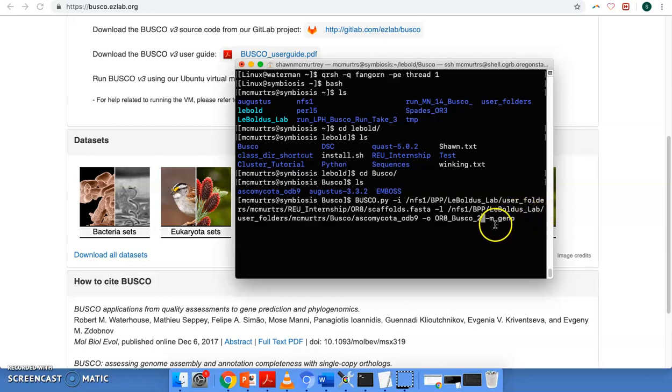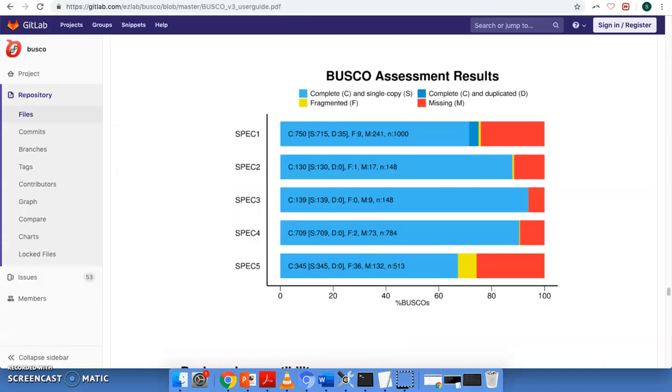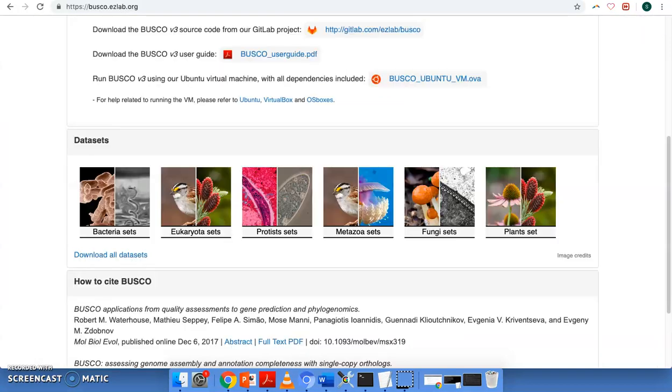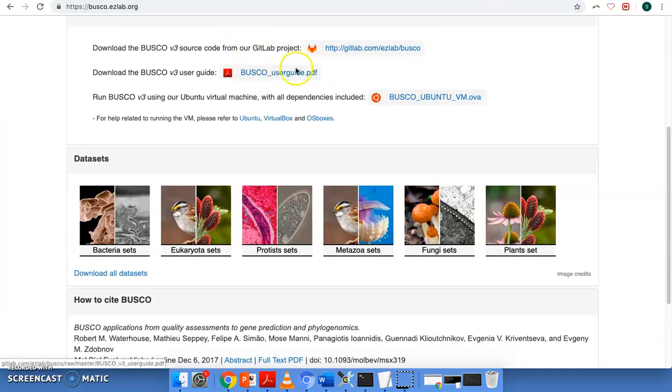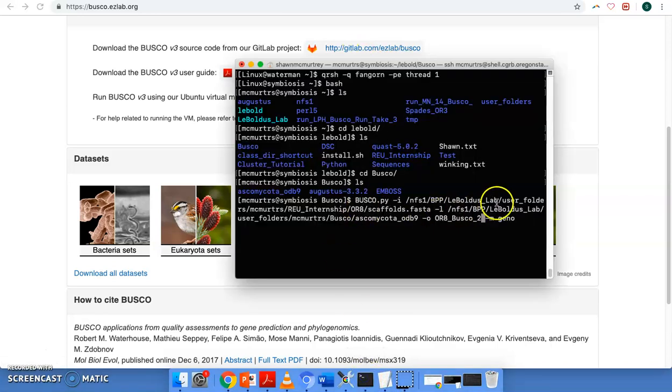And then dash M genome, I can't remember that command exactly, but it's in the manual, the busco manual user guide, which can also be found at the website here. So yeah, so let's go ahead and run this command and see if it works.